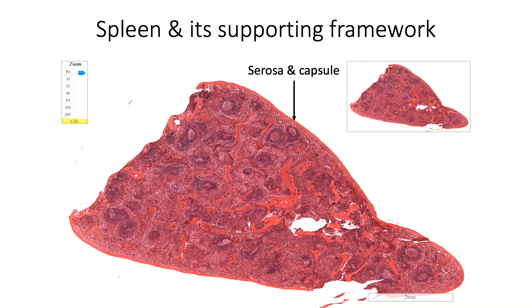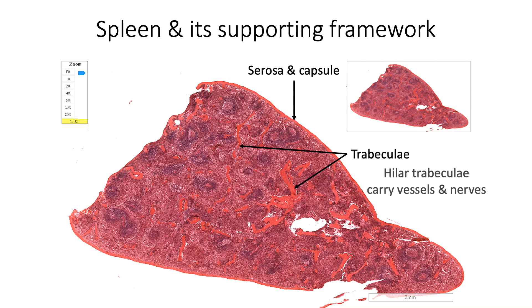Beneath the peritoneal lining, spleen is covered by a thick capsule made up of type 1 collagen fibers and elastin fibers. Numerous trabeculae extend from the capsule. The largest trabeculae enter from the hilum and carry the blood vessels and nerves. Within the spleen, there is a delicate network of type 3 collagen fibers, or the reticular fibers.